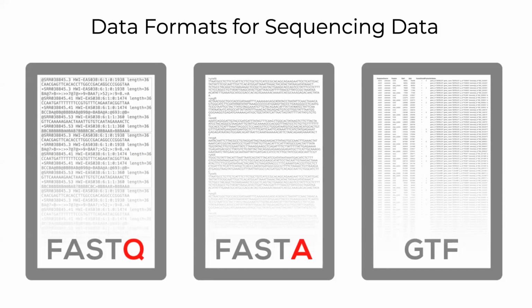Okay, so now we have some interesting questions. How does the platform compare to using Terminal and other tools such as Minimap2 and SAMtools? Technical question, right? What is the output of next generation sequencing data? I will be talking about that in just a second. And can we identify mycoplasmas through metagenomics? So all great questions, right? I suggest looking at some of these online resources. That's why we provide them, for filling in the gaps as we go through the session.